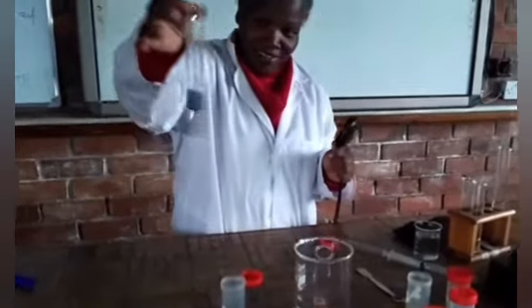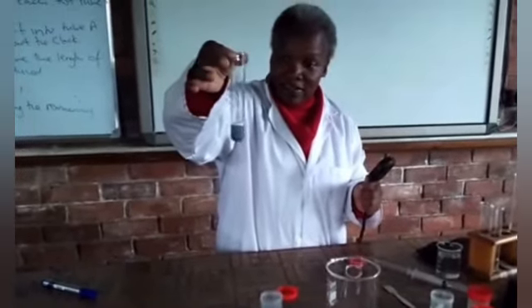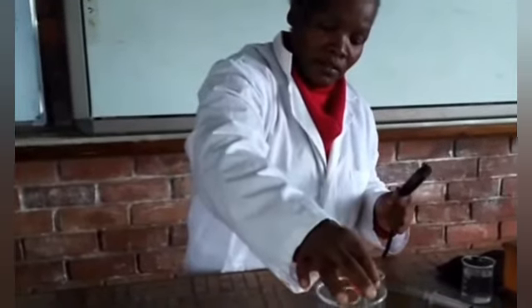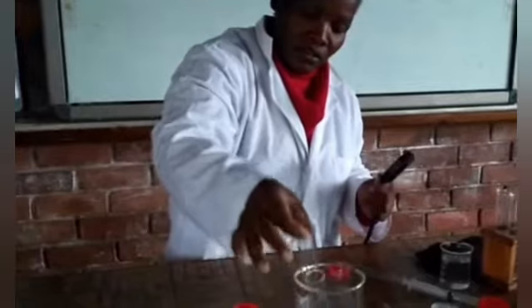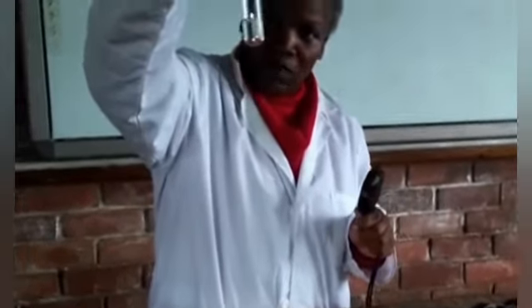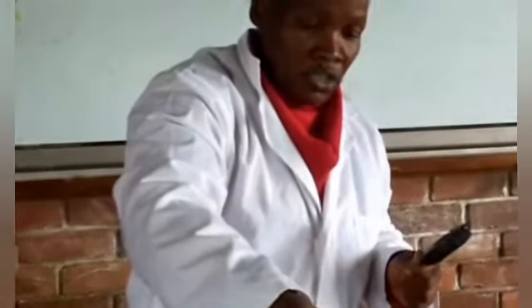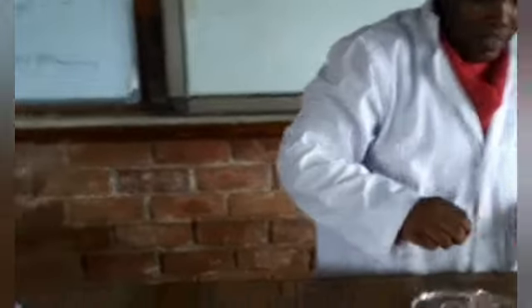Oh, look at Mr. Zinc there, it's really coming up. Okay, then for copper, you can even check the bubbling. There are no bubbles really being produced in here. Then after it's 2 minutes, I want to add the third element, which is lead.